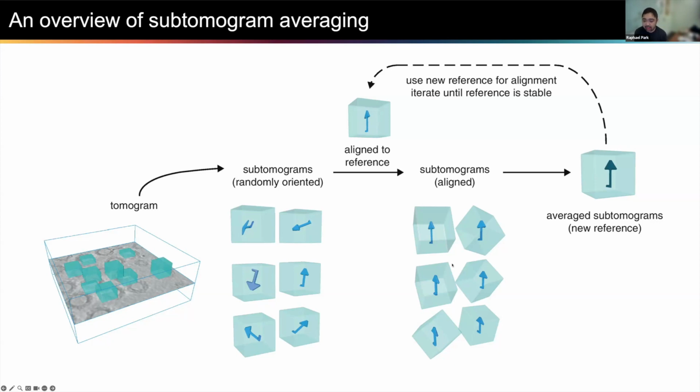So technically, it's very similar to single particle reconstruction, but in this case, we're using 3D raw material versus 2D raw material. Of course, now there is software that uses 3D tomograms but then refines the particle in 2D images. So those are the latest technology. I'll get to them in a few slides.